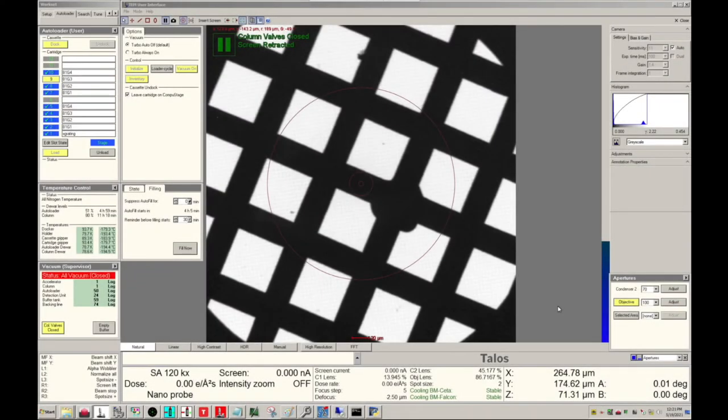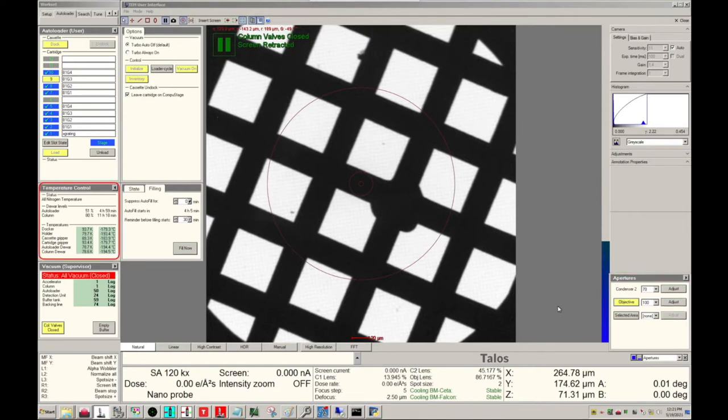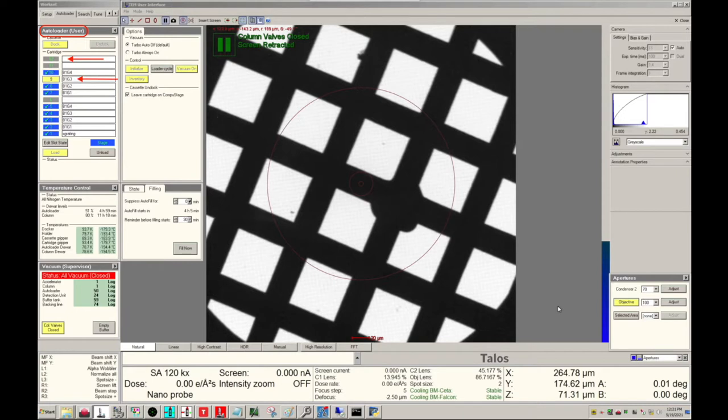On the Microscope PC we see the vacuum panel. Make sure column valves closed is yellow, which means true, and that the values are green. We want to make sure the scope is left in SA-MAG. In Aperture, take out the objective if it's yellow. Temperature control should be set to all nitrogen temperatures. In the autoloader we can see empty slots in gray, the grid currently on stage is yellow, and other grids in the cassette are blue.